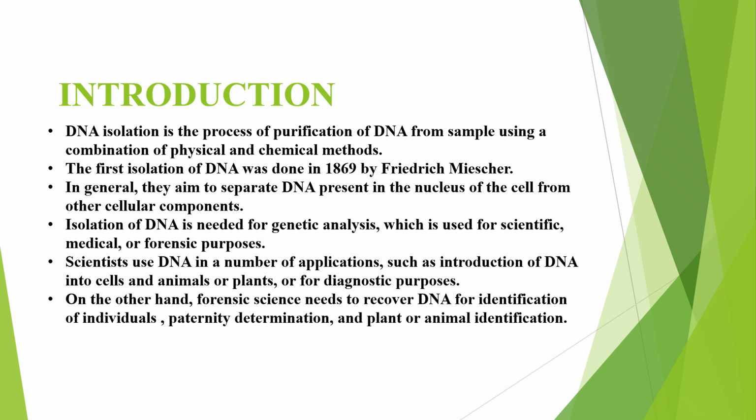As we all know, DNA is deoxyribonucleic acid, which is the hereditary material present in almost all living organisms. This DNA carries the genetic information that determines an individual's physical traits and biological function.